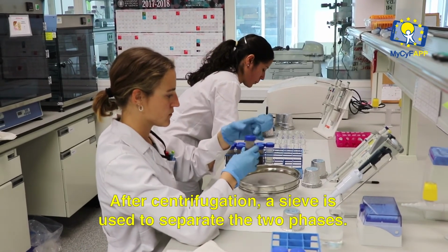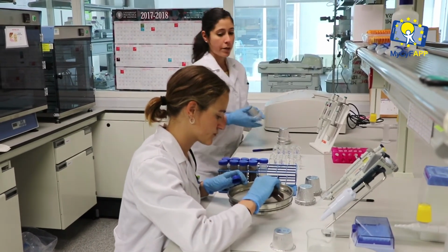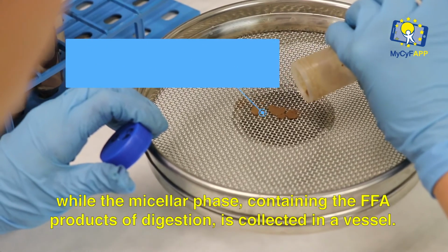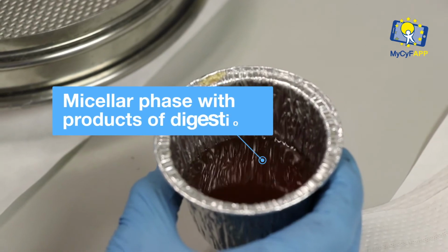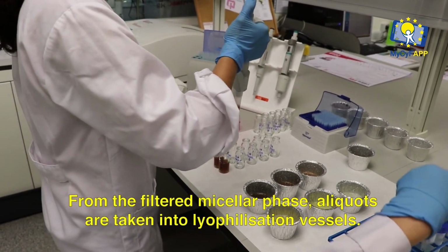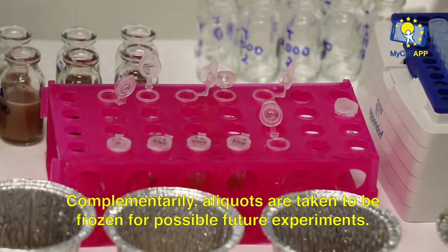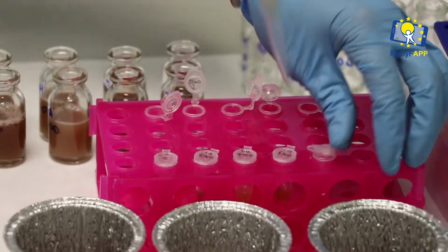After centrifugation, a sieve is used to separate the two phases. The solid undigested phase remains on the sieve, while the micellar phase, containing the free fatty acid products of digestion, is collected in a vessel. From the filtered micellar phase, aliquots are taken into lyophilization vessels. Complementarily, aliquots are taken to be frozen for possible future experiments.